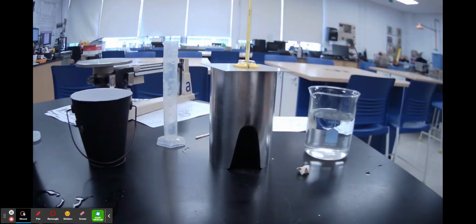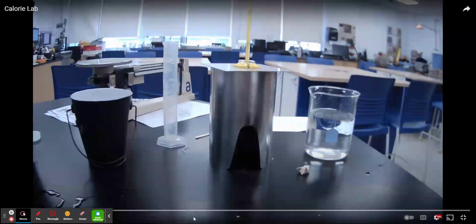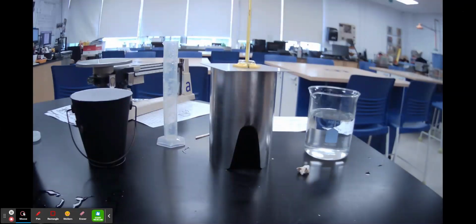All right, this is Unit 2.2, the Calorie Lab, or carbon-based molecules. In this lab, you're going to experimentally find the calories of 4 food samples and compare those to the calorie content on the nutrition label.